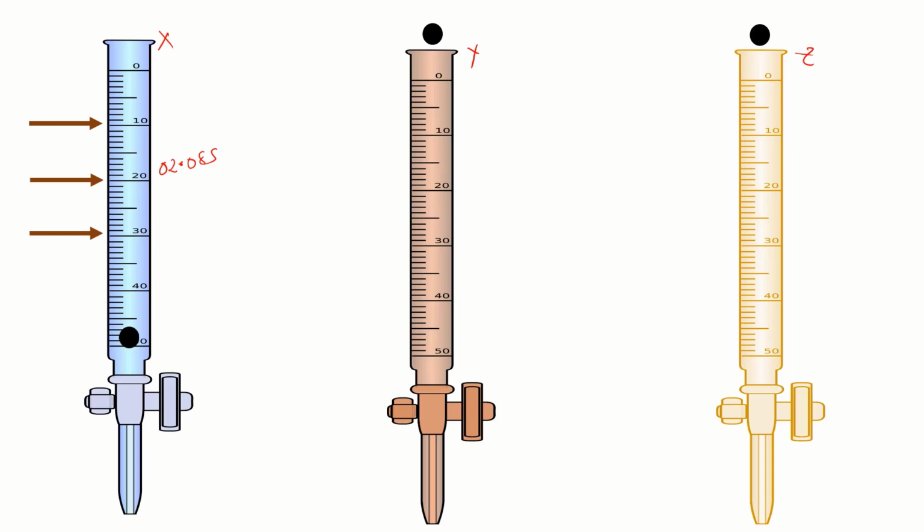Now let's see what the second gives. Let's go back. Okay, I have about 1.02 seconds.